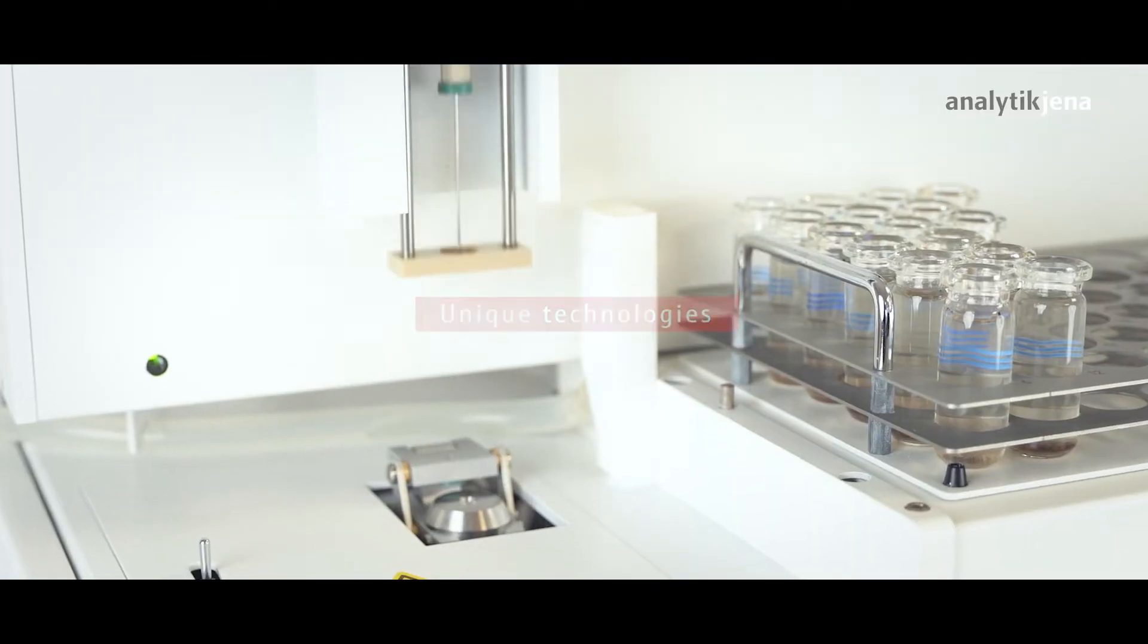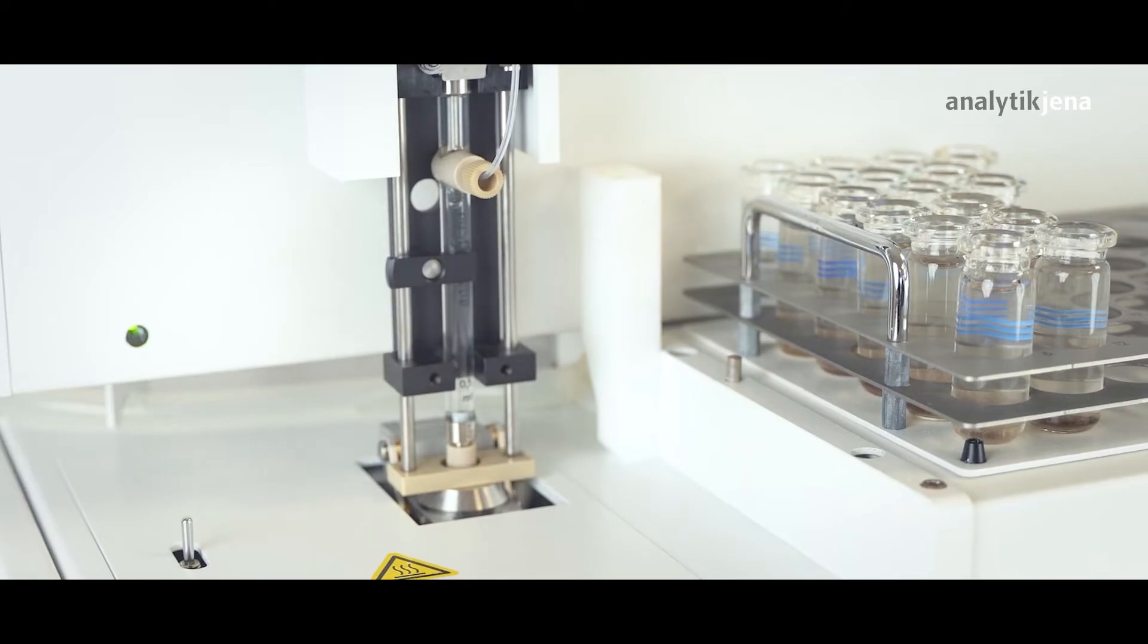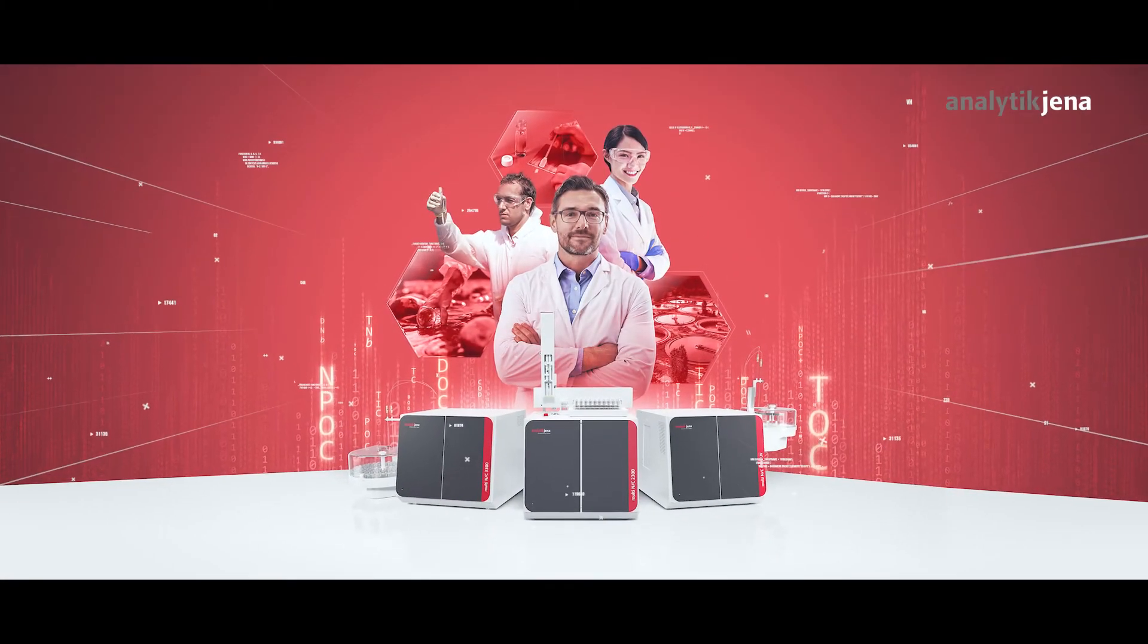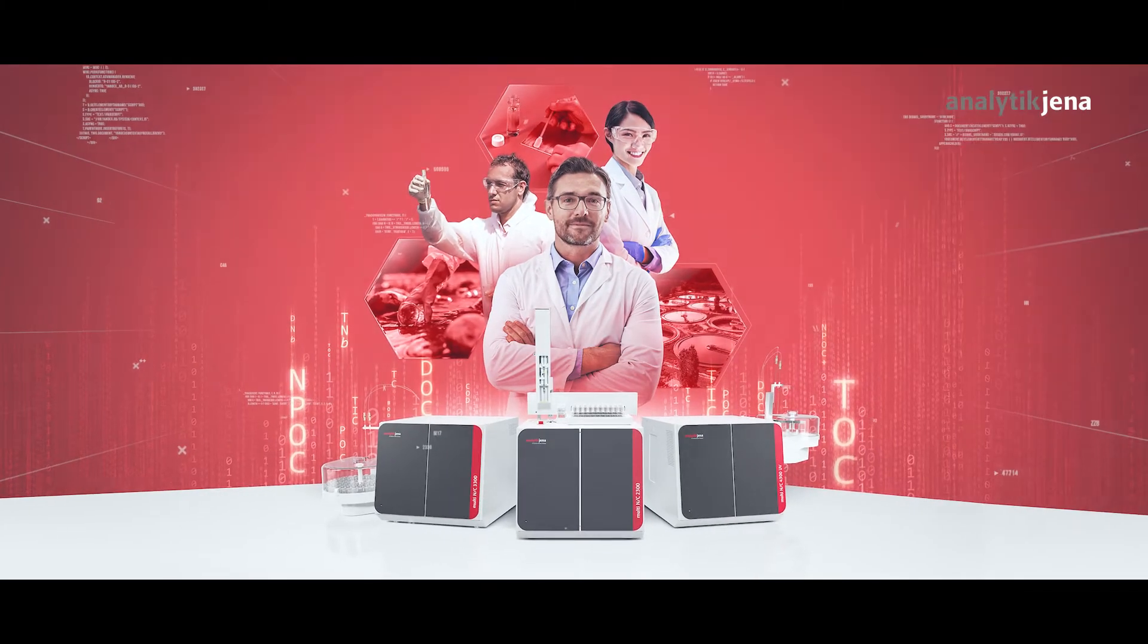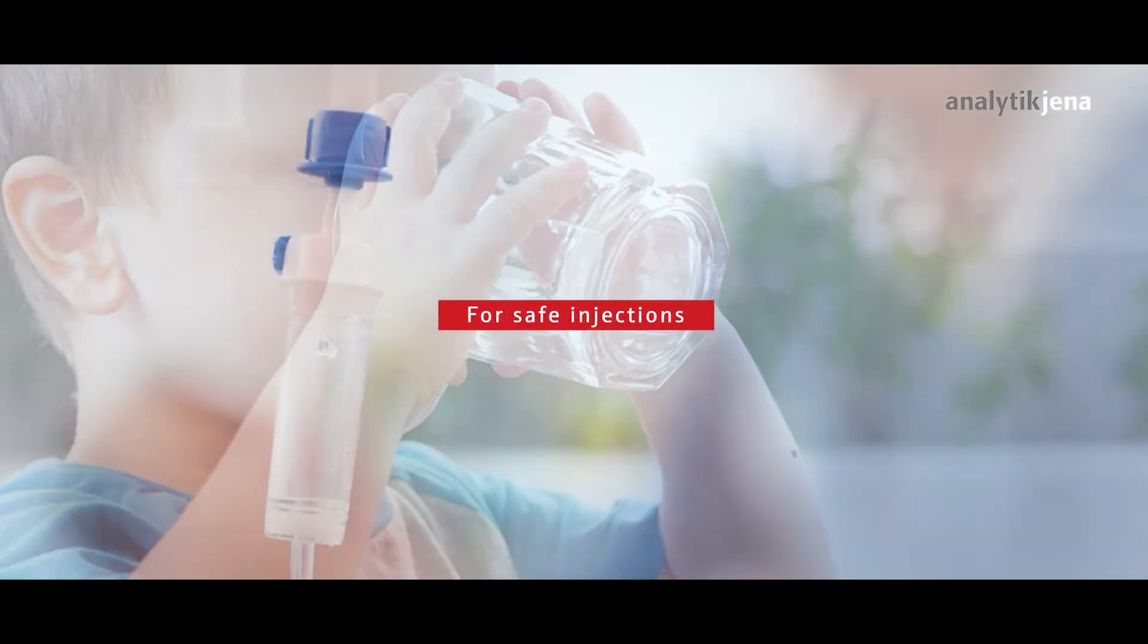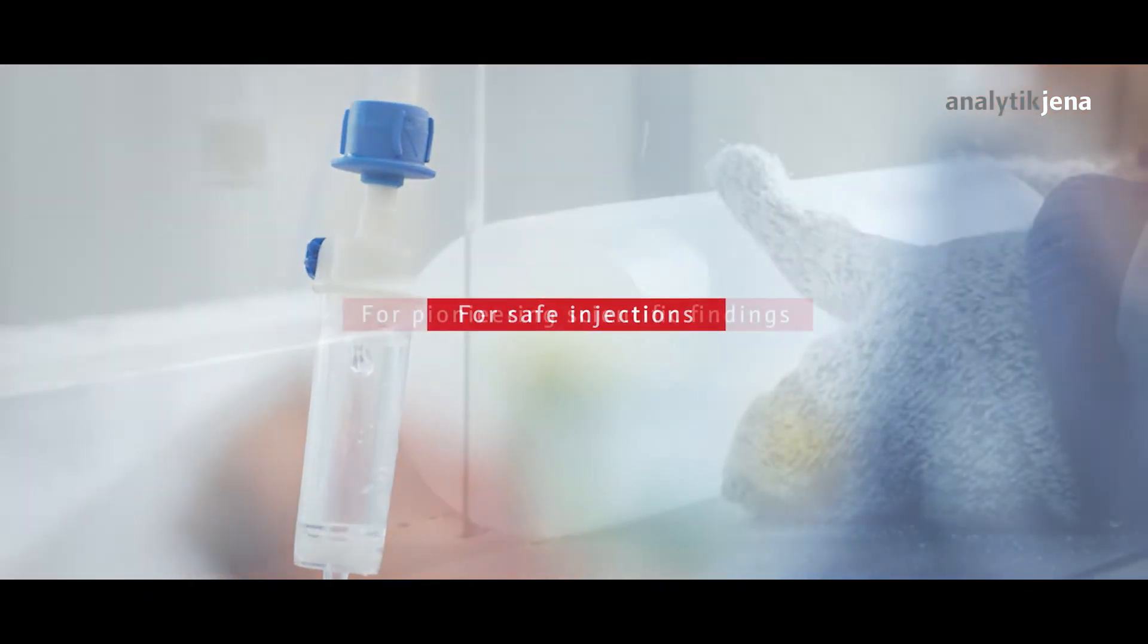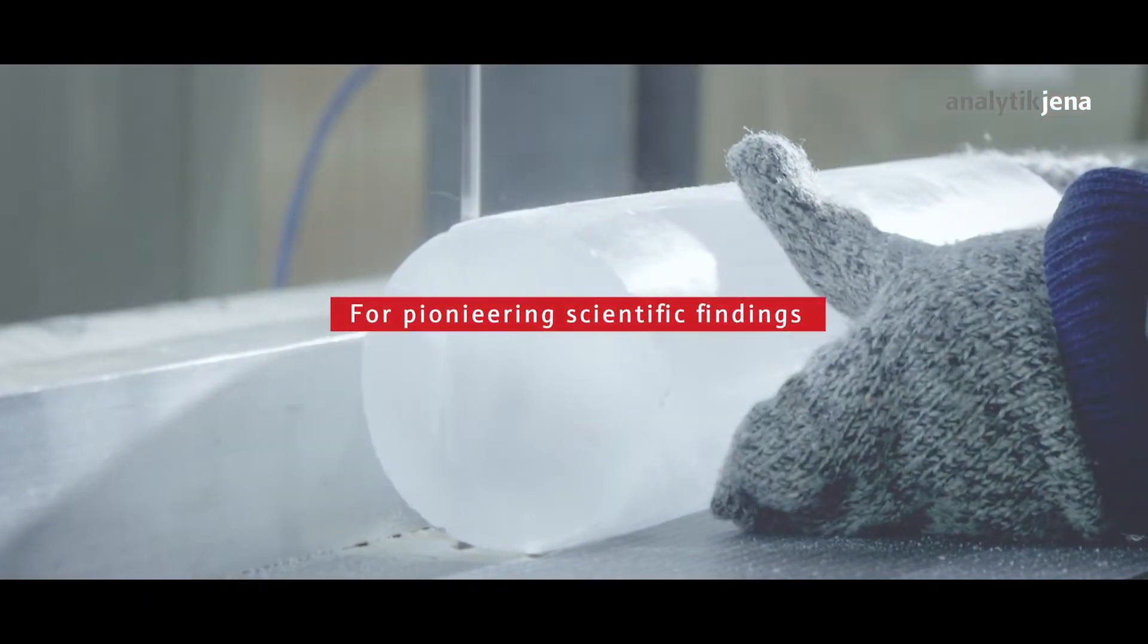Benefit from our unique technologies. Discover a TOC analyzer that delivers results you can rely on. For hygienic drinking water, safe vaccines and injections, and pioneering scientific advancements.